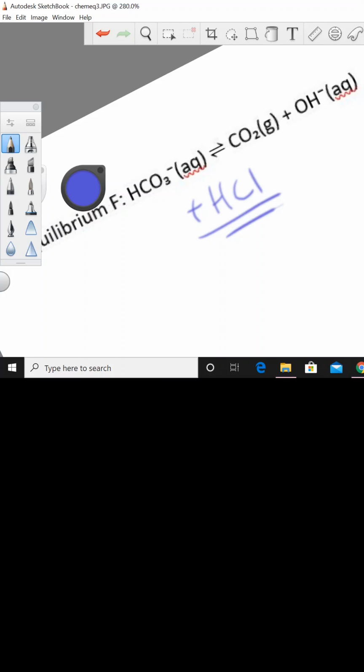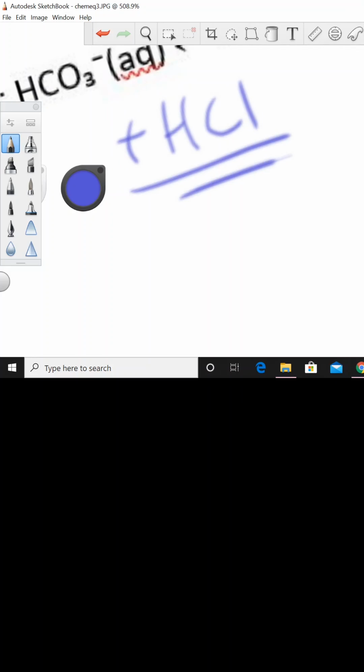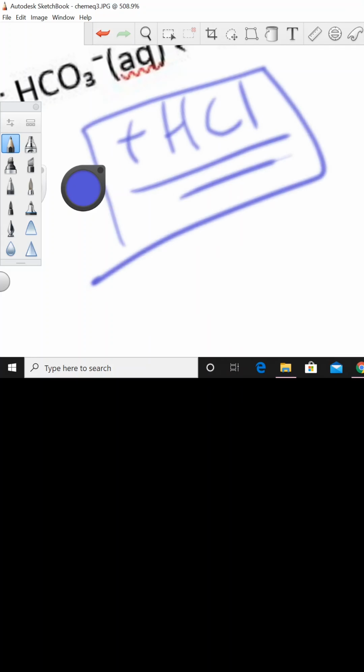So I'm going to sort of conclude from this that because we started blue, and the HCl is what caused the color change, which was removed by the aspiration, I'm going to say that it was the HCl that was removed from the aspiration.